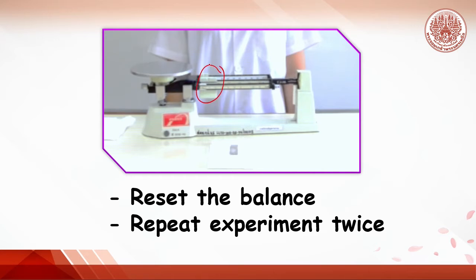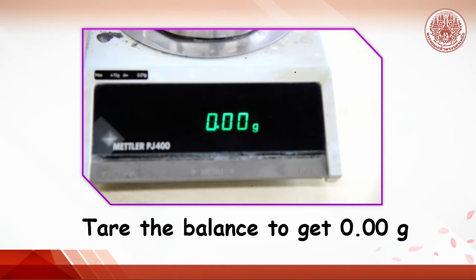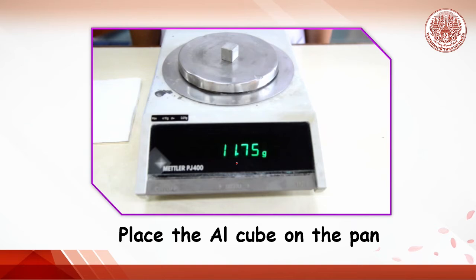Take all weights back to zero and repeat the experiment twice, then calculate the average weight of the aluminum cube. For the electrical balance, first make sure the display shows 0.00 grams; if not, press the tare button. Place the aluminum cube on the center of the pan, and record the weight after the G indicator appears on the display.